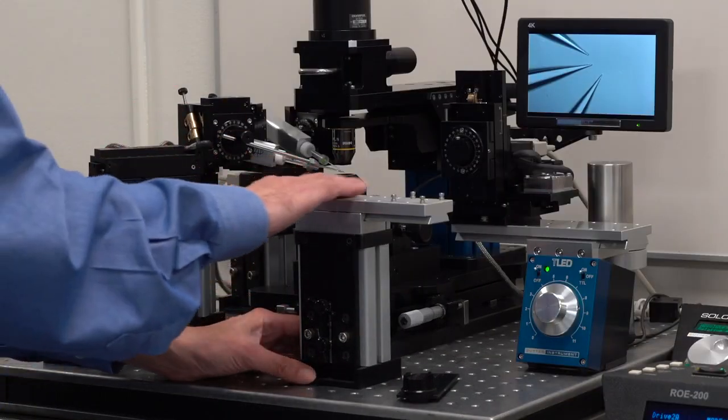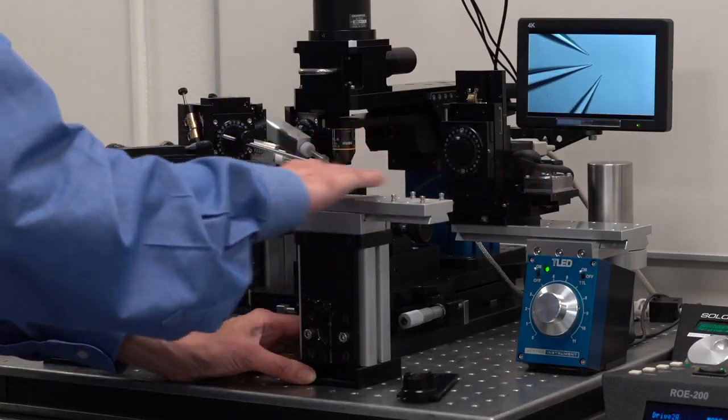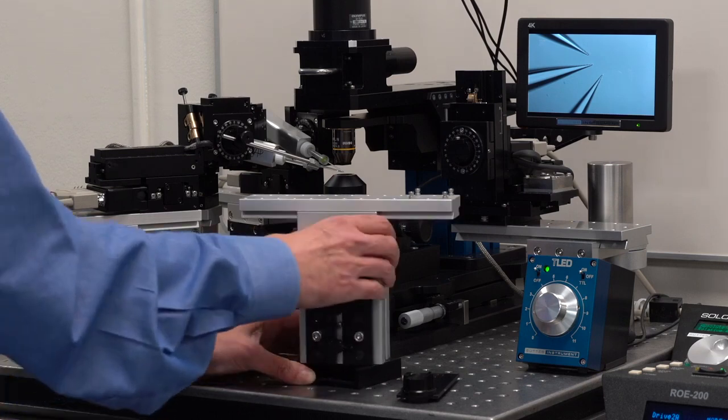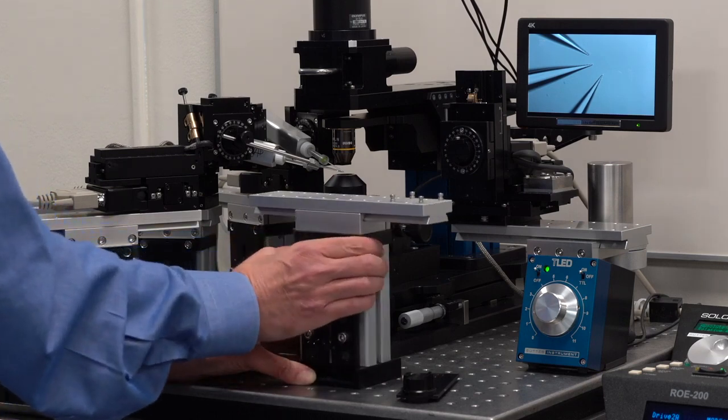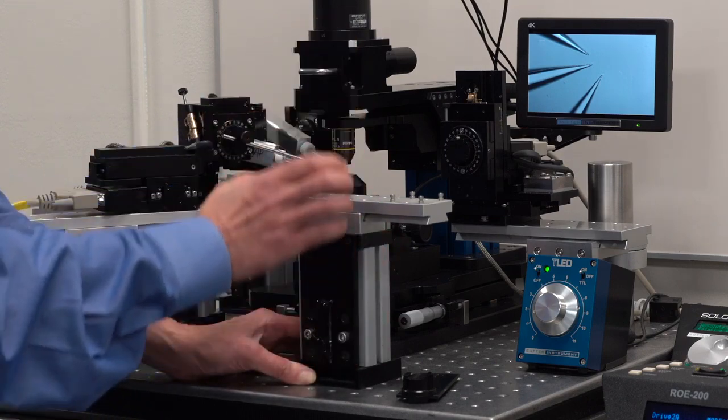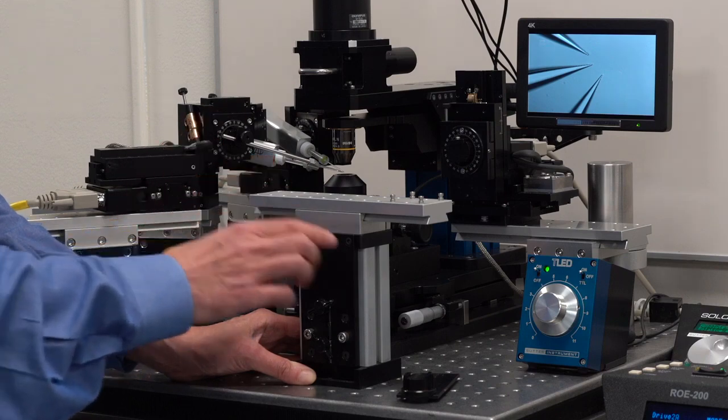These stands, like the rest of my stands, can be adjusted in X. They can rotate for the Y-axis adjustments. And they can be adjusted in height.